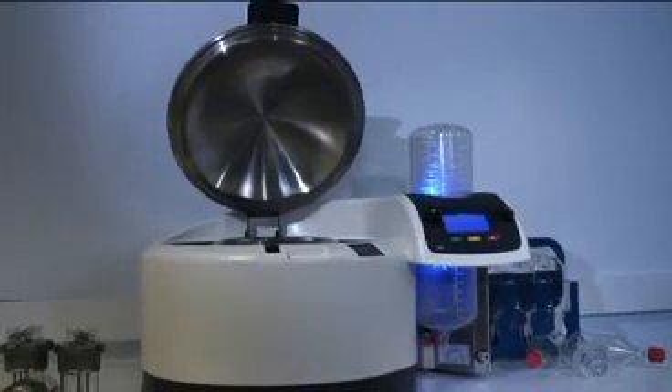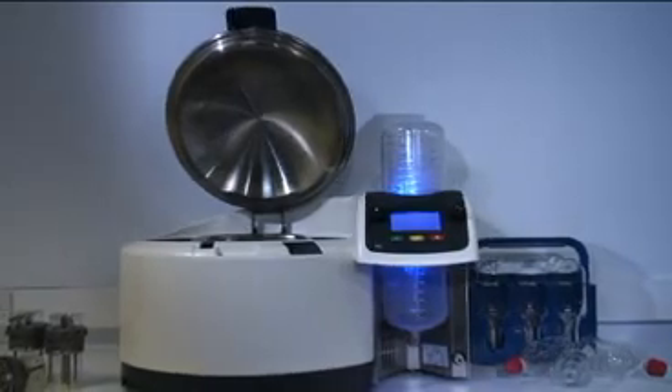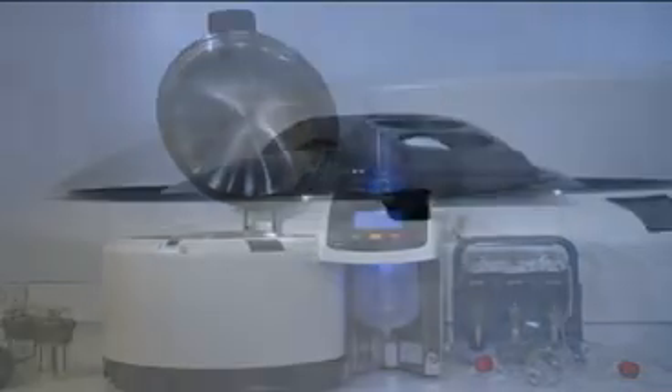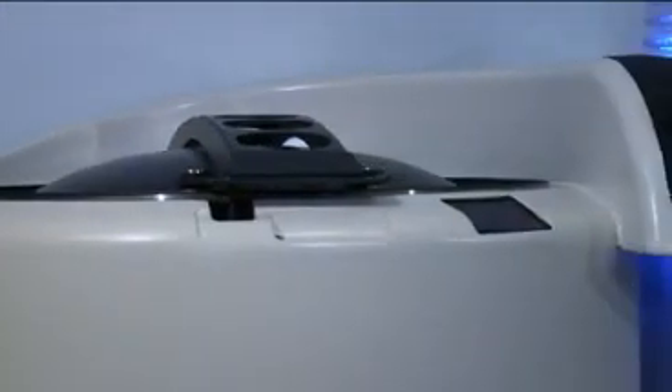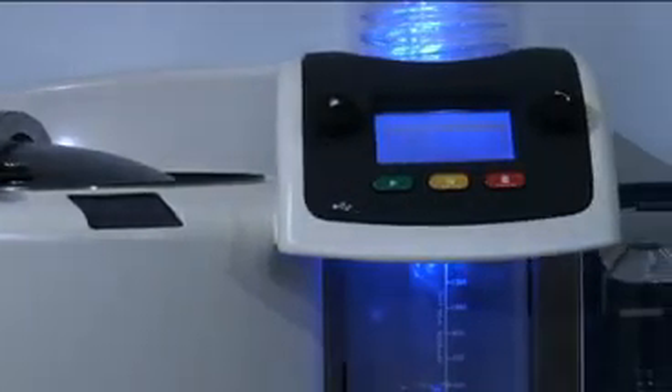The Rocket is a unique high-speed evaporation system specifically for the evaporation and concentration of large volumes of solvent. The speed and functionality of the Rocket evaporator and its accessories provide significant work savings in the laboratory.